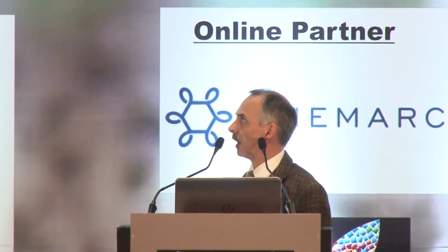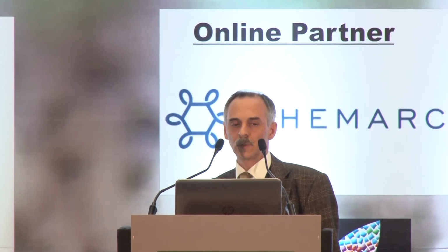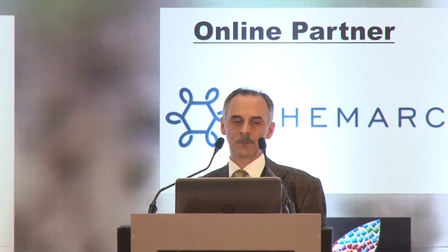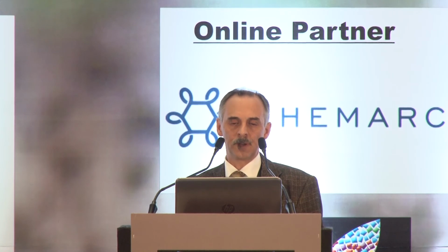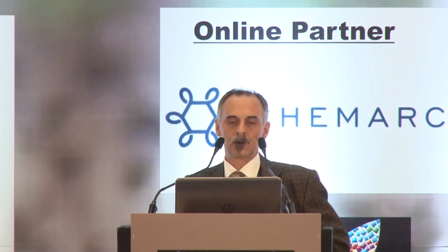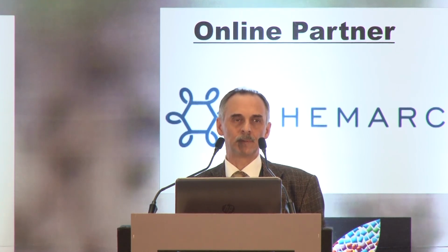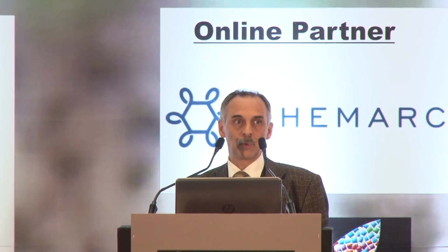So the last point is the mechanical inspection of the system. In this case, we need a defined sample size. This means we have to cut the edges to get only the middle area of the film where we have a defined constant film thickness. And we measure this film thickness with a contact thickness gauge. And with these values, we also measure the mechanical load and can calculate the mechanical properties of the sample. So that was the last point, and thank you very much for your attention.